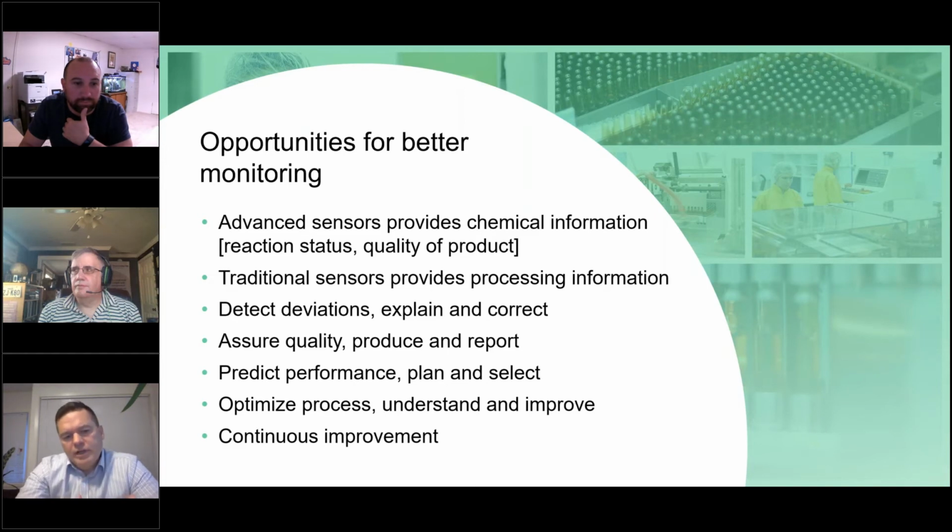And as we are getting more and more insight, we can start to think about predicting the performance of a reaction, do planning and selection maybe of reactant batches and the like. And also, of course, as we are getting better at this, we can start to think about optimizing our reactions, understand them better and improve them even further.